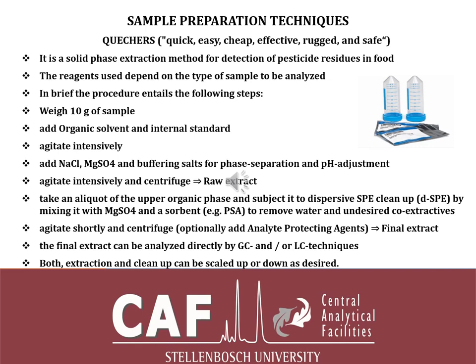But also, for instance, just a brief example, when we were analyzing for acrylamide in potato chips, we weighed the potato chips, and then we added water, and then we added acetonitrile.